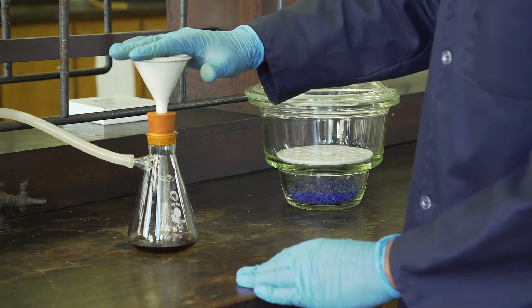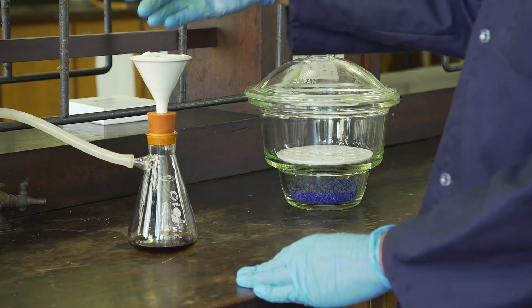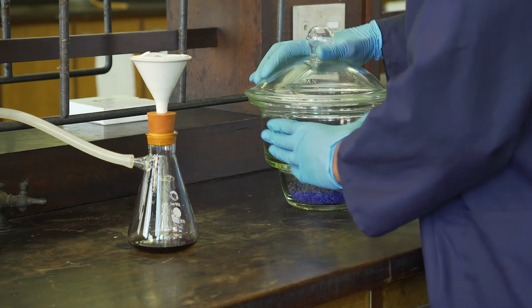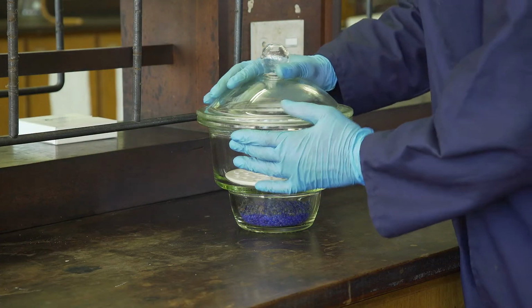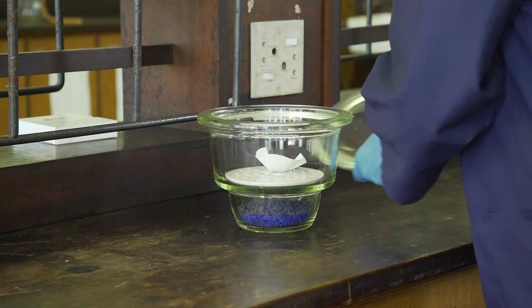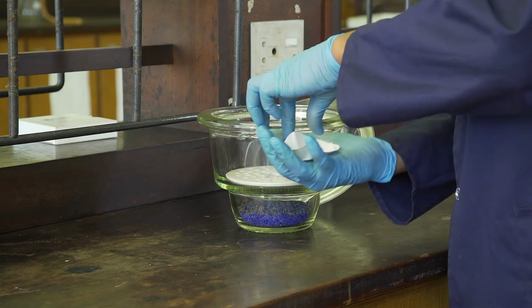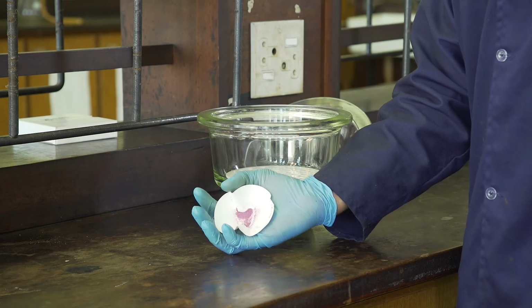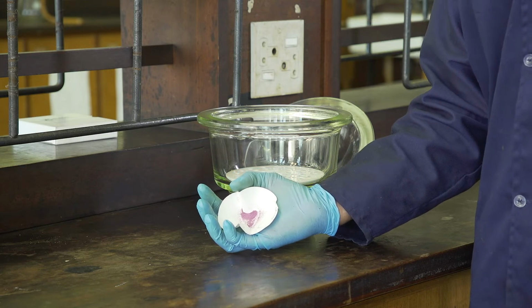And once all the filtrate has passed down the filter, we will transfer our crystals inside a desiccator for drying overnight. Once our chromium acetylacetone crystals have dried overnight, we will then measure their mass on top of the filter paper in order to determine the percentage yield obtained.